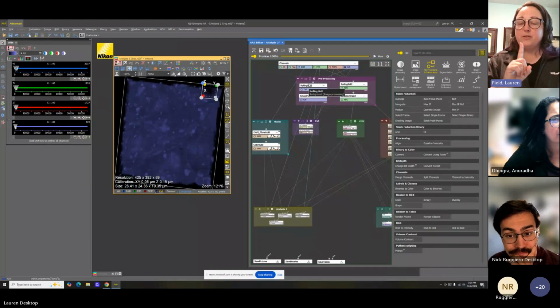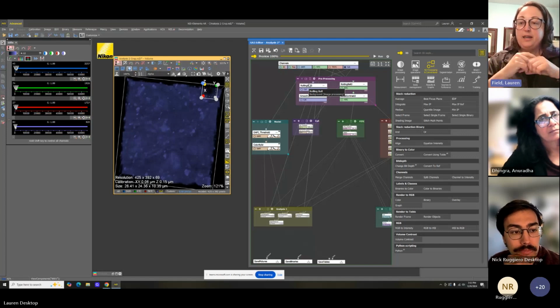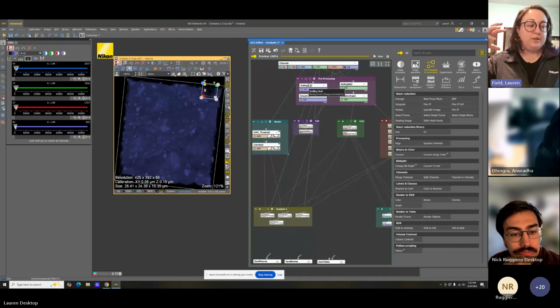What this is going to do is it's going to take every single pixel, average an area around it of intensity and then subtract that from that center pixel. You can decide how many pixels wide that subtraction is. This is essentially like if you mowed the grass, anything within the top layer of grass will disappear, but the structures you really care about, like, I don't know, your garden gnome, will start standing out better against the grass level in the background.